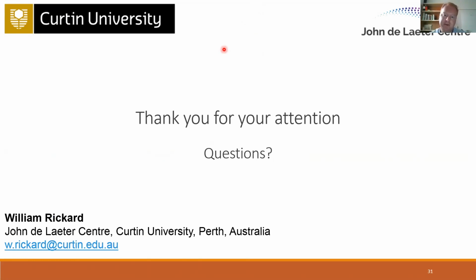Yeah, the issue with coatings is that because you're physically removing material, any coating that you put there, you're going to sputter away early in your analysis anyway. So generally not. There is some really nice work being done at ETH in Switzerland on signal improvement, particularly for negative ions.